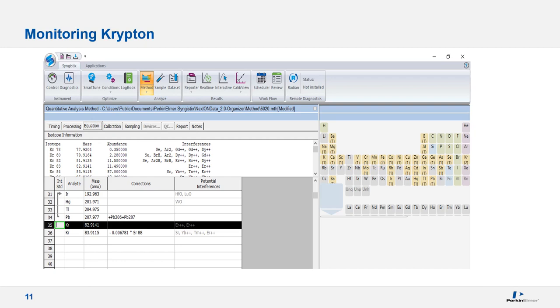Many labs analyzing arsenic and selenium for EPA Method 200.8 can have issues when their krypton levels become elevated within their argon plasma gas. Depending on the type of argon tank and where it is located, customers can see these levels change throughout the day. If your argon tank is getting lower, the krypton will become more concentrated within the tank and you can have issues meeting lower limits of detection. If you monitor your krypton at masses 83 and 84, you will be able to see if this is causing analysis issues. This may mean getting a new tank of argon or having help from your gas vendor — typically vendors are not testing for krypton, so they may not be aware until you tell them.